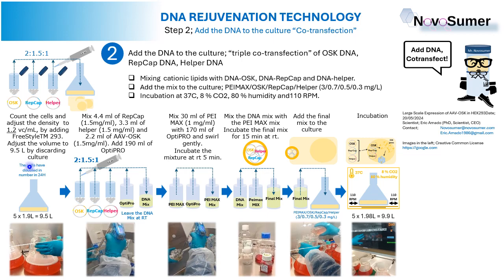So this step is just adjusting the cell density and discarding a little bit of the culture. So we have the culture ready here. We leave the culture there, incubating, and we go for the following step.